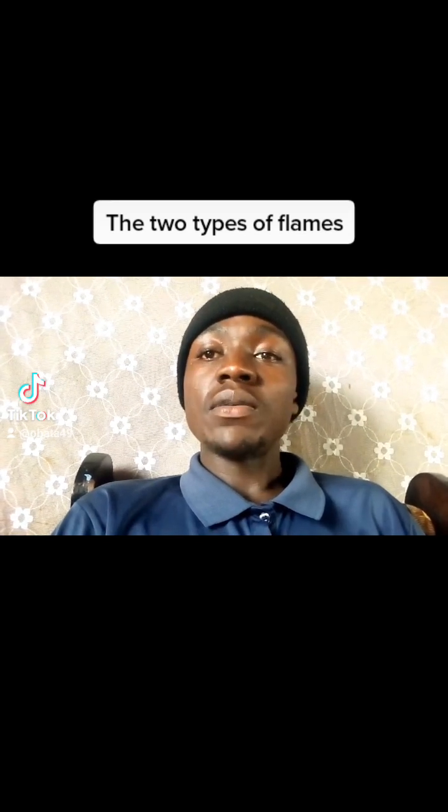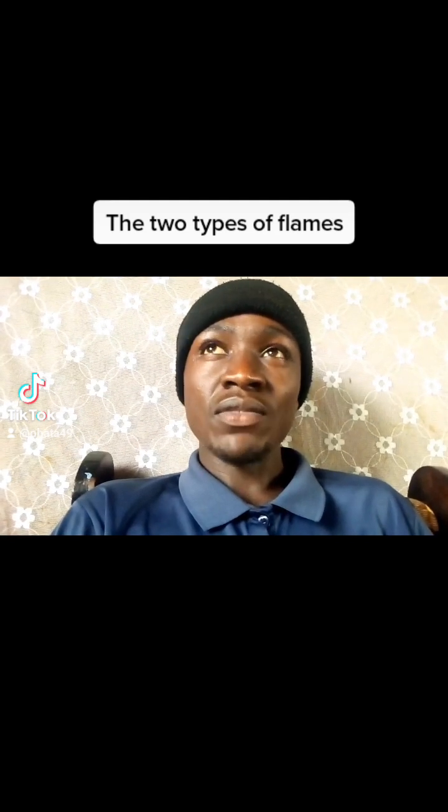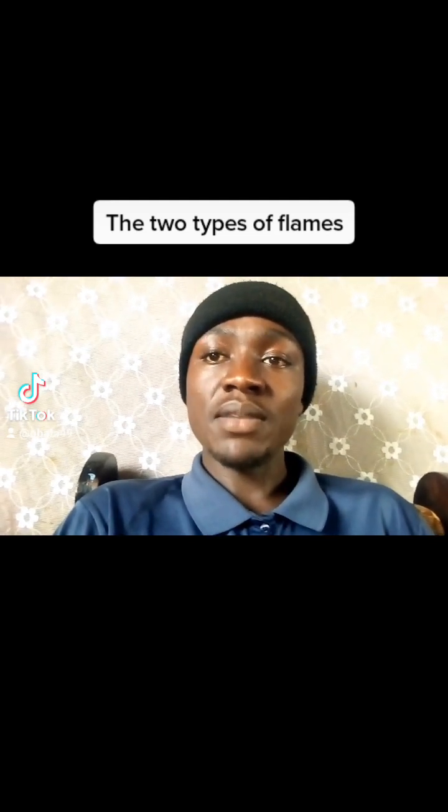Now, we have the sources of heat in the laboratory. One of them is the spirit lamp. The second one is the candle. The third one is the portable burner. We have the kerosene stove, and we also have the Bunsen burner.